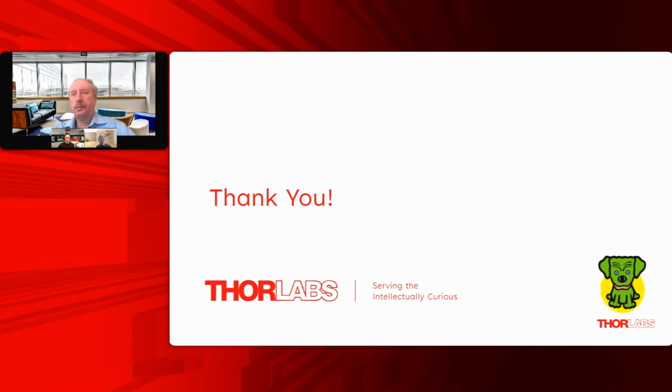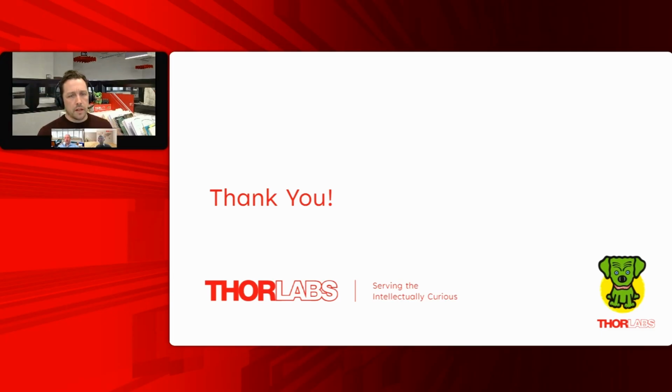Feng, the QCLs you had, in the context of today's talk, you were mentioning that these are broadband sources. I mean, not as broad as a supercontinuum, of course. But the question is, shouldn't lasers be narrow? Why are these broad?